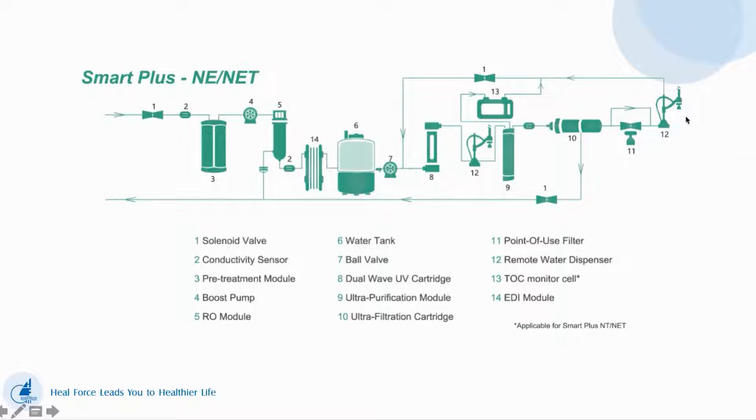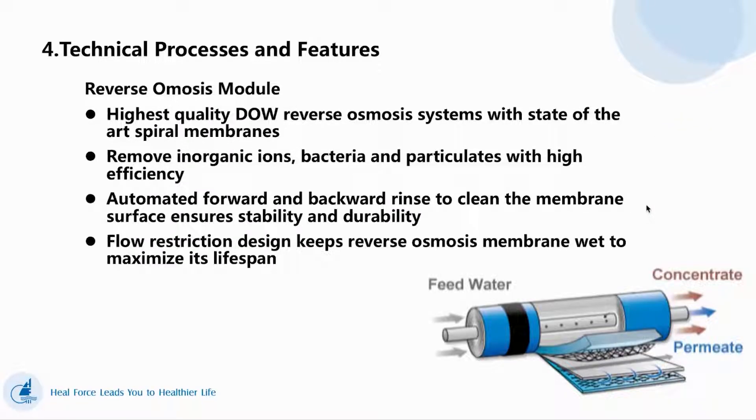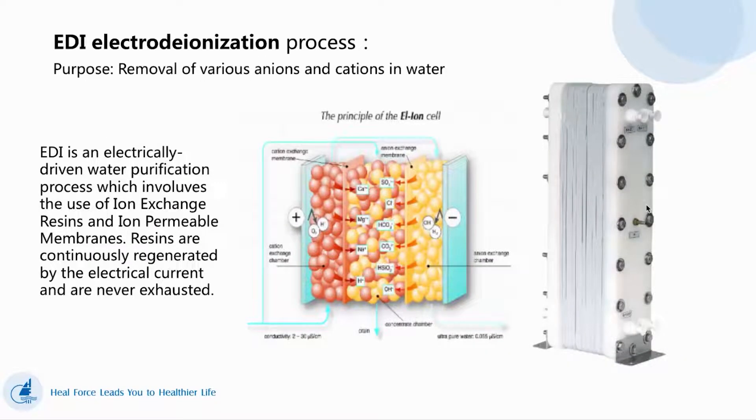This is our remote water dispenser. This is our pre-treatment cartridge — we have PP cotton and active carbon. This is our RO. This is our EDI. EDI is an electrical driving water purification process which involves ion exchange. The resins are continuously regenerated by electrical current and never exhausted.